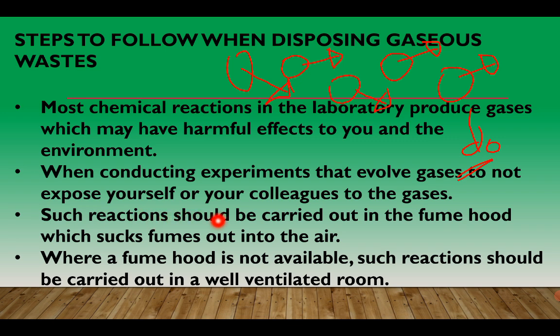Such reactions, therefore, should be carried out in the fume hood, which sucks fumes out into the air. Fume hoods are special cabinets. It's like a box in which you can carry out the chemical reactions. The fume hoods are connected to the outside environment by use of a pipe.